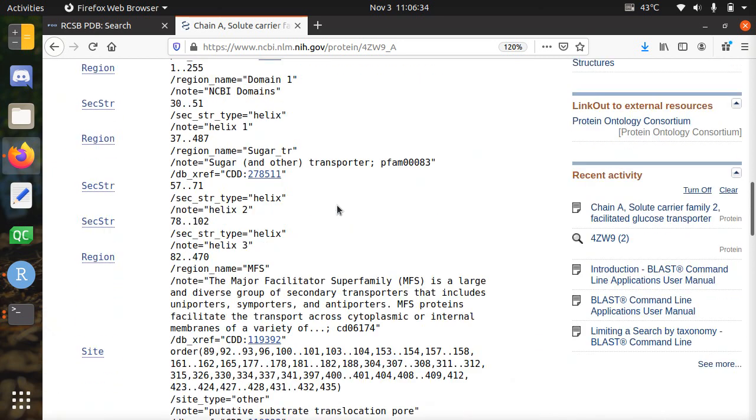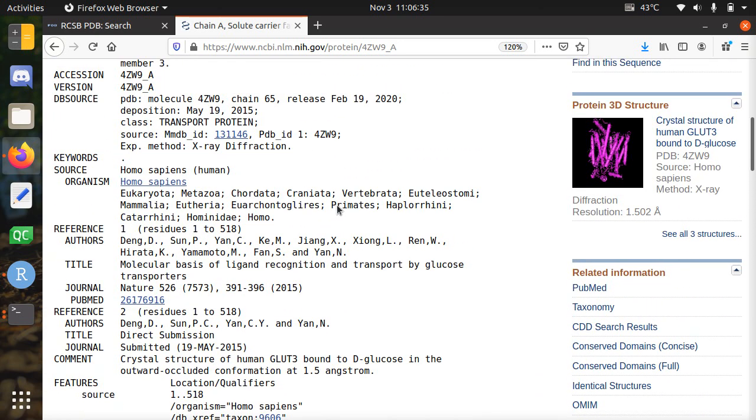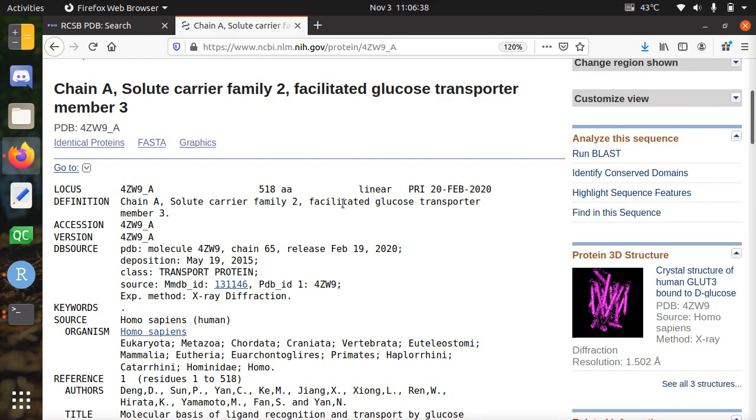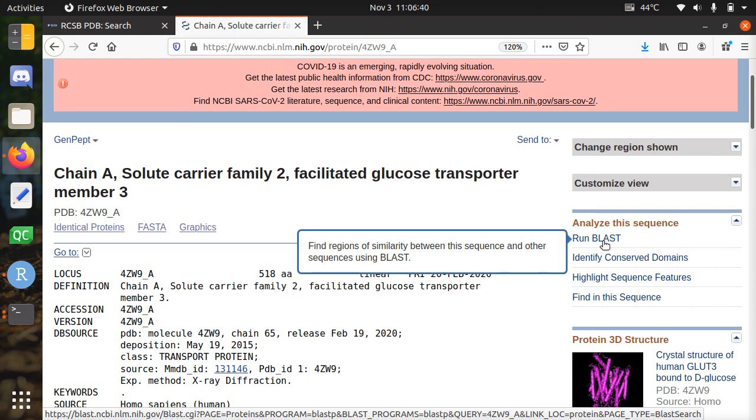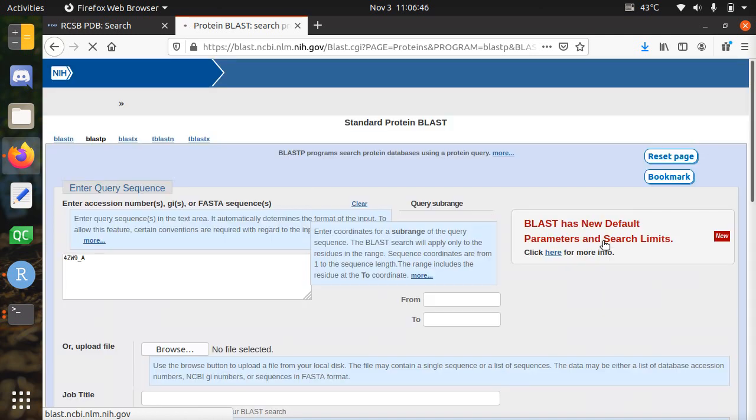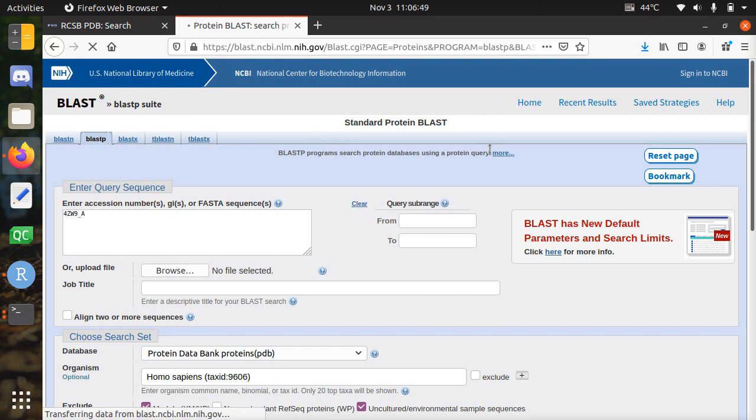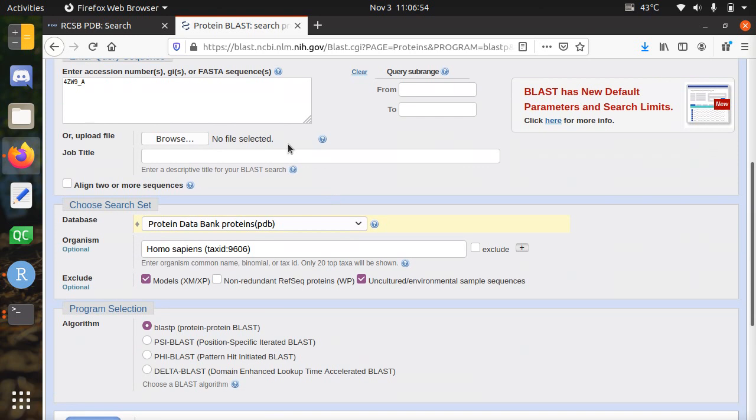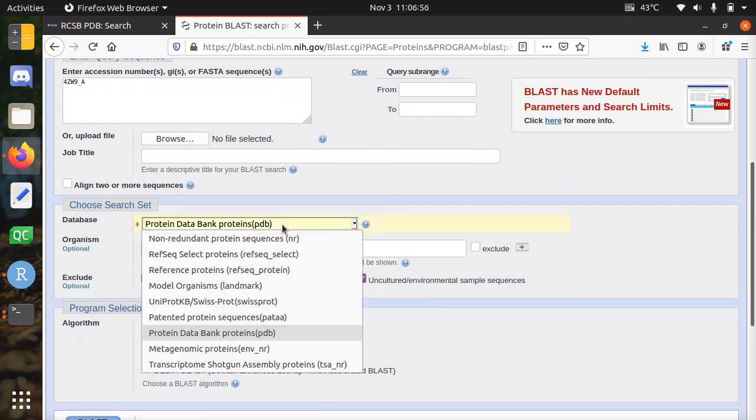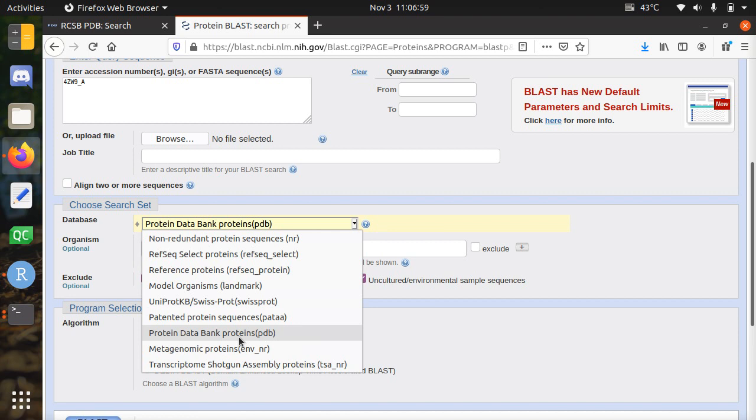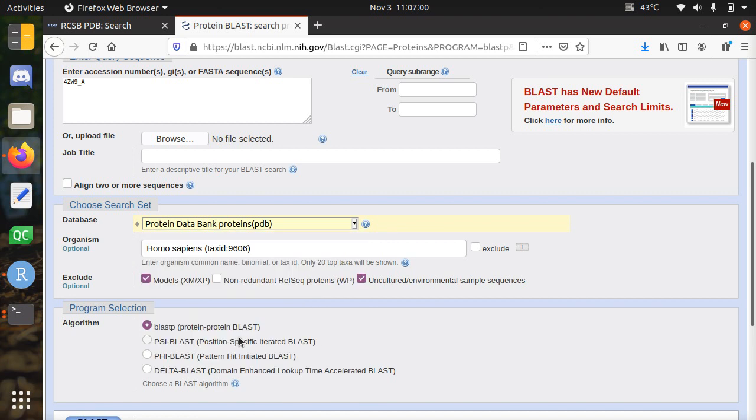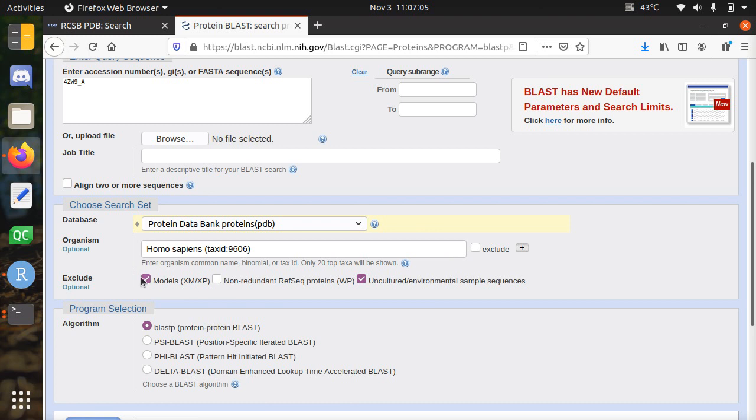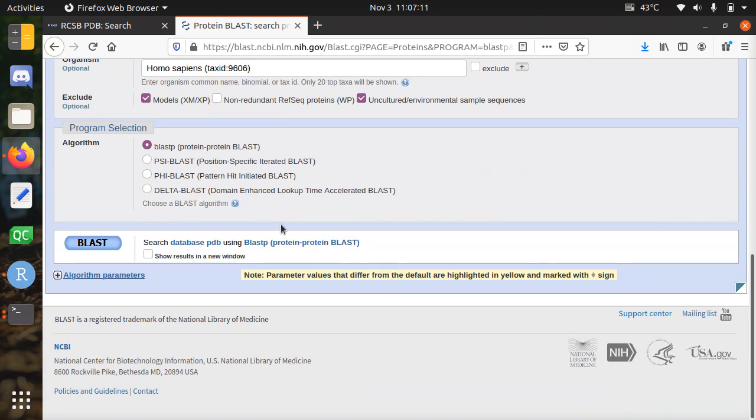Now I'm going to find related sequences. To do that, you go to the right side—there's Run BLAST. BLAST you would associate probably with genomic sequences, but for protein you run BLASTP. You need to pick a database, so I use the protein data bank. I'm only interested in humans in this case. I exclude these two because I didn't know what they were. I use the default one, and you BLAST it.